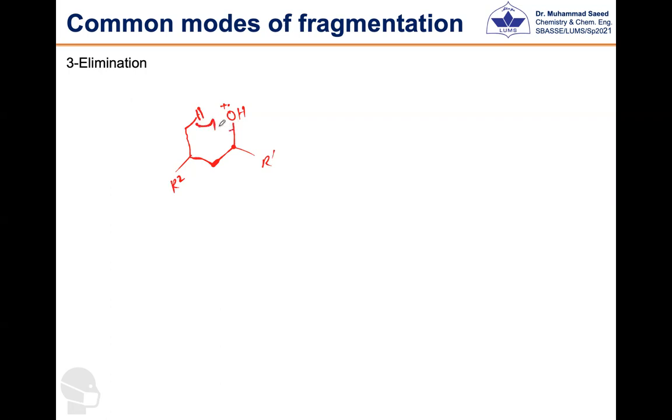like this way, like this. So of H and OH, one electron from the OH and one from the H combine to make a bond, the H-O-H bond, which is H2O, which is a neutral molecule. And after this, the remaining electrons of these bonds will recombine to give the cyclic type of structure.